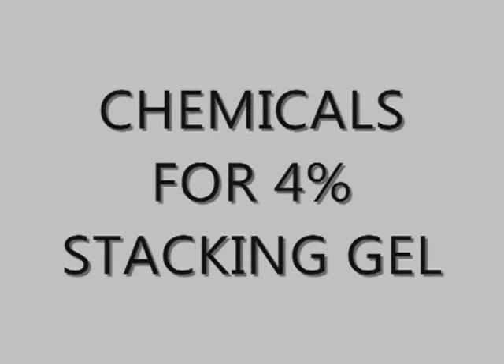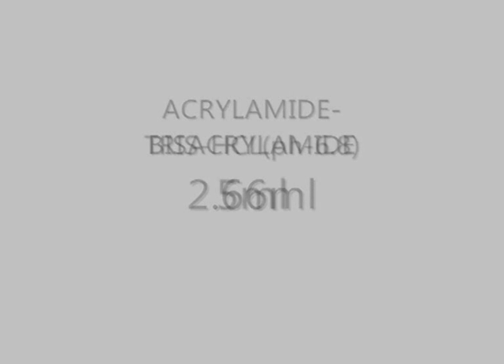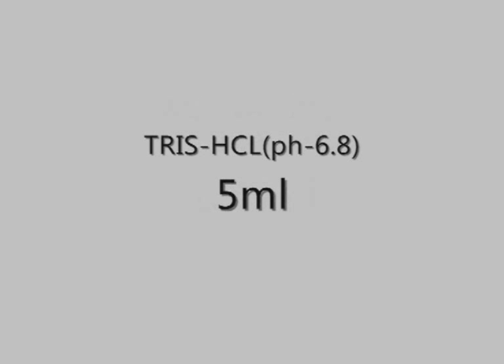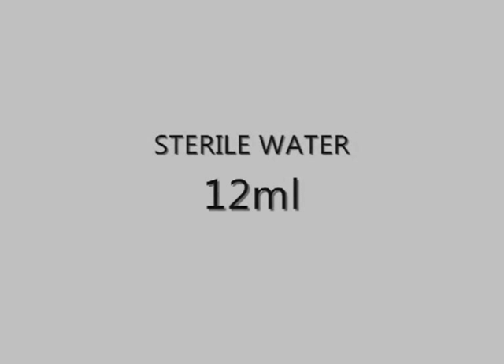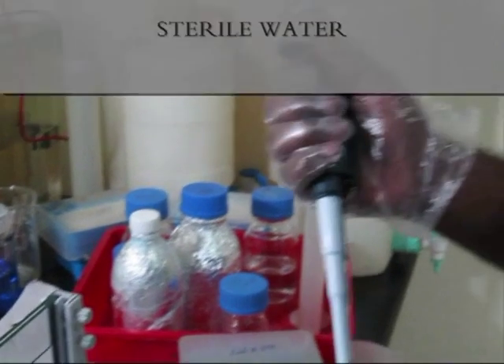Chemicals for 4% stacking gel: acrylamide bisacrylamide 2.6 ml, Tris-HCl at pH 6.8 at 5 ml, sterile water 12 ml, ammonium persulfate 105 microlitres, 10% sodium dodecyl sulfate 150 microlitres, and TEMED 21 microlitres. Sterile water is being added.